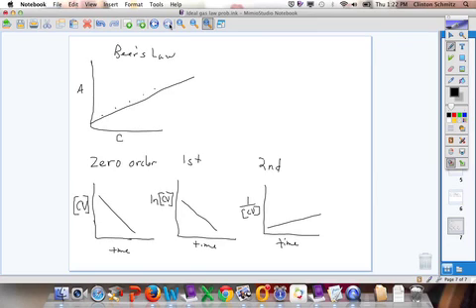Now, the first thing I did is I made a Beer's Law plot, which I showed you on the other page. And then the second thing that I did is I put Crystal Violet with sodium hydroxide, and we had the absorbance over a given time. As they react slowly, the absorbance, you can see by looking at the Logger Pro graph in a second, decreased with time. And so it looked something like that.